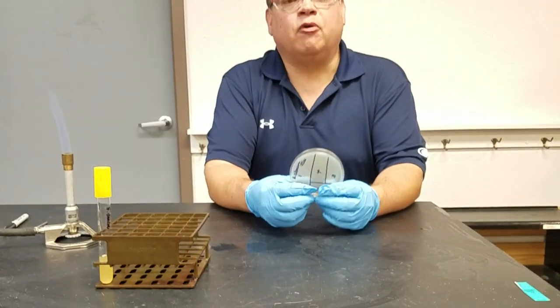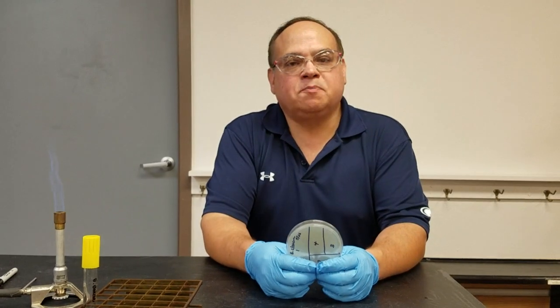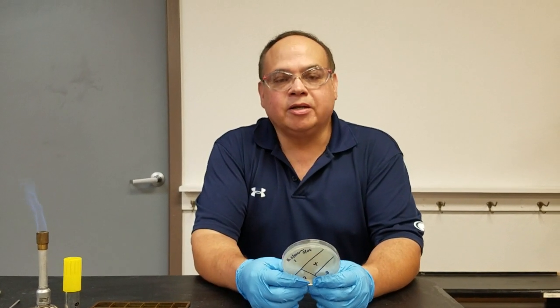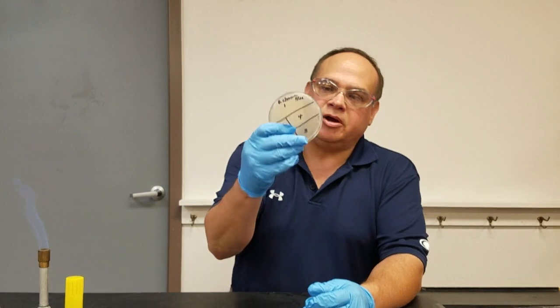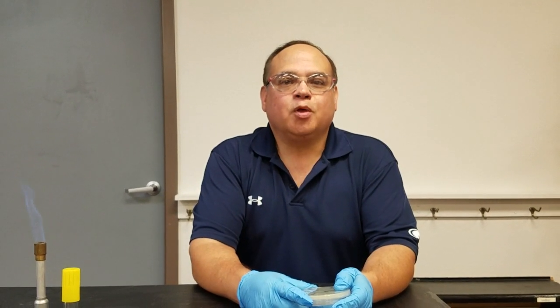So again, this is the streak plate method for isolation. It takes a large population of microorganisms and dilutes it using the entire surface area of the plate so that you get isolated colonies which you can use to further study whatever organism you're working with. Thank you.